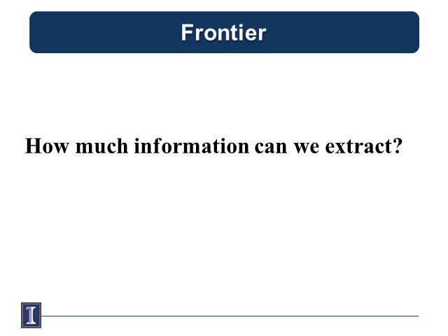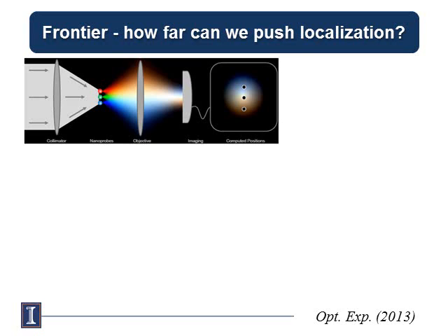I'll give you a very brief example. This is a piece of theoretical work. We haven't implemented this quite as nicely yet. But here what you have are three species in the same focal volume. Think about it: three small spheres, for example, 3 nanospheres sitting in the same focal volume of a far field microscope. We're illuminating them, so there's a spot size here and the 3 are sitting there. The question is, if we know that there are an arbitrary number of particles sitting in a focal volume, can we recover the centroids of each of those particles? We have to be careful here. We're not claiming I can recover the shape of those particles. I'm just saying, can we localize the centroid of chemically distinct species in a focal volume using spectral data?